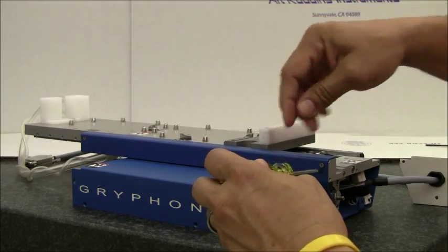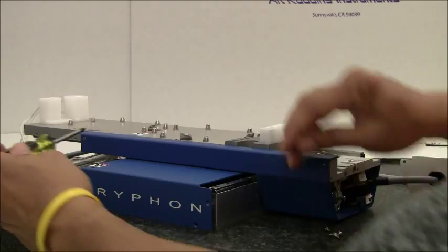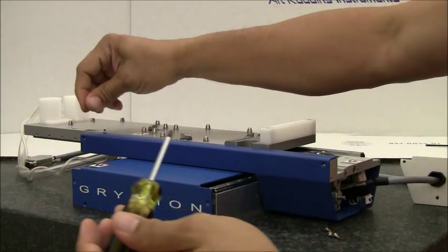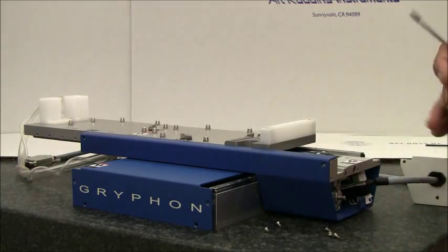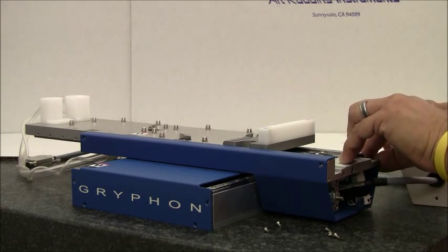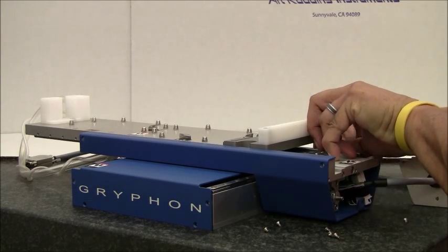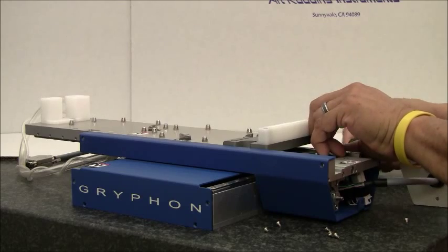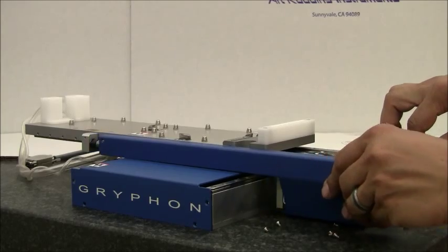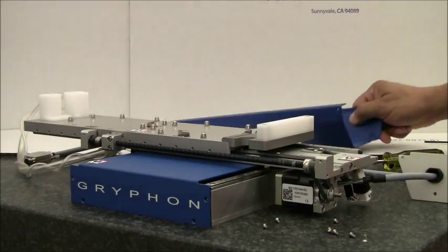There are four screws — two in front, two in back. The guard will slide out, exposing the motor.